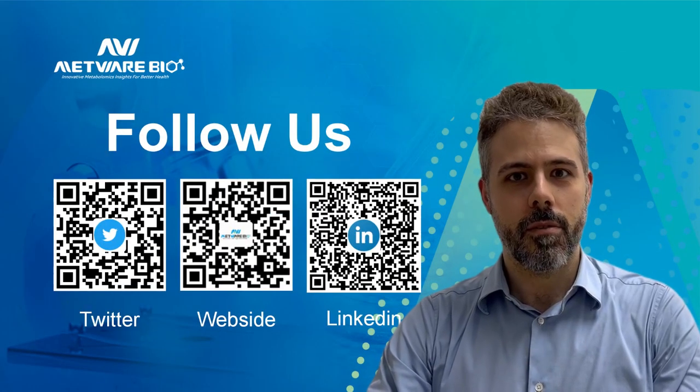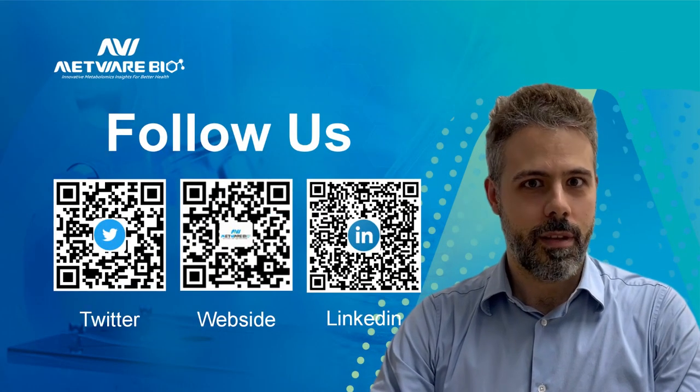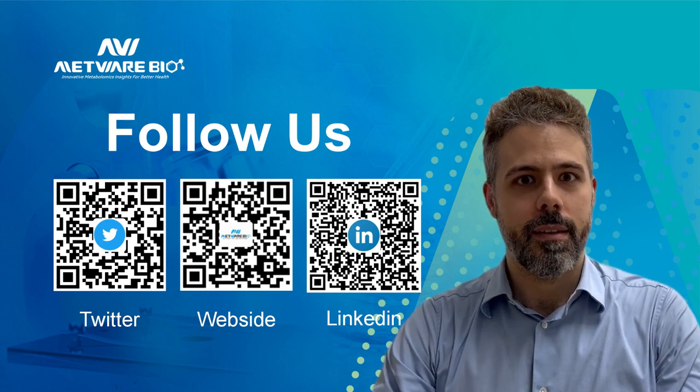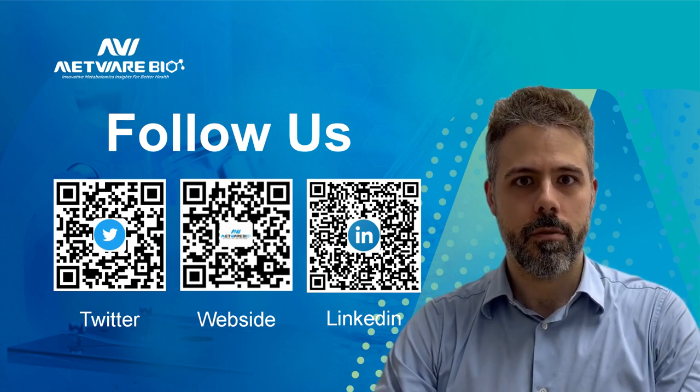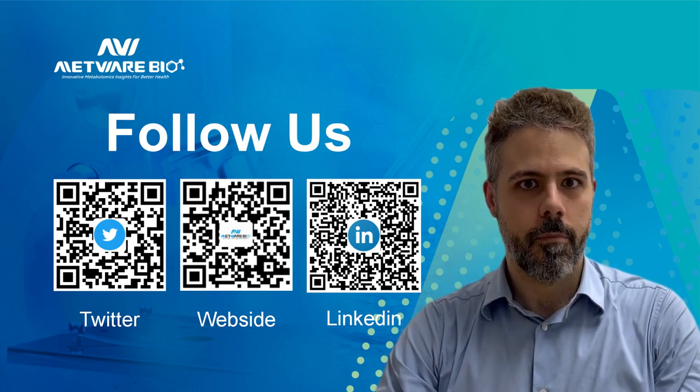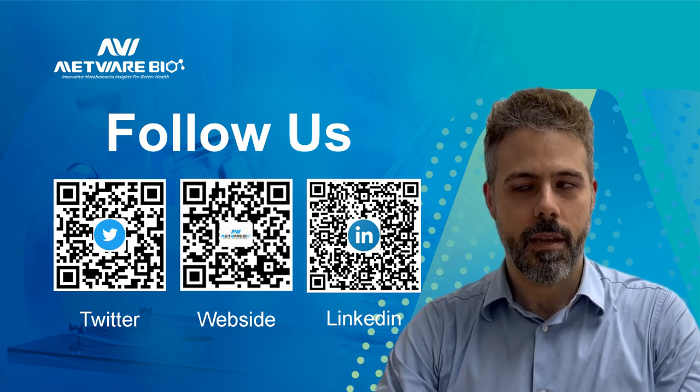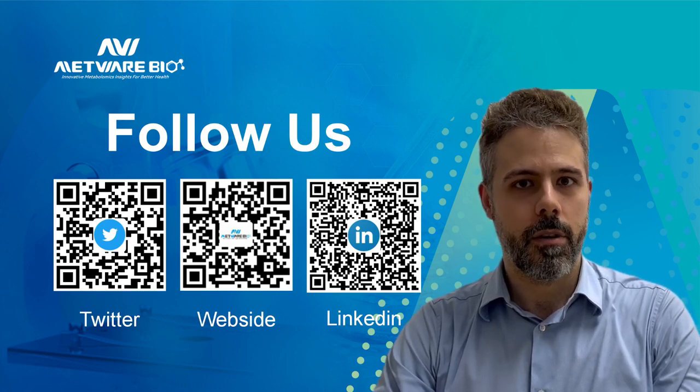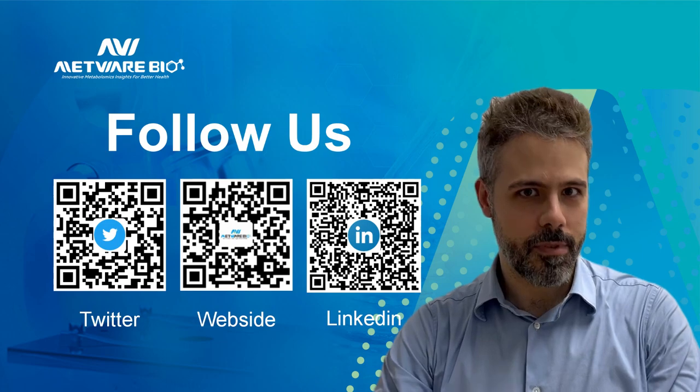So this concludes the introduction on the online heatmap tool. And in the next issue, we will see how to use the tool for principal component analysis. You can follow METWARE Bio on our social media, and I hope to see you there.